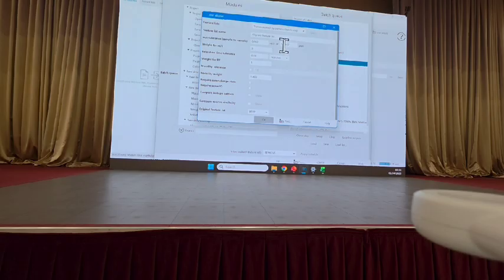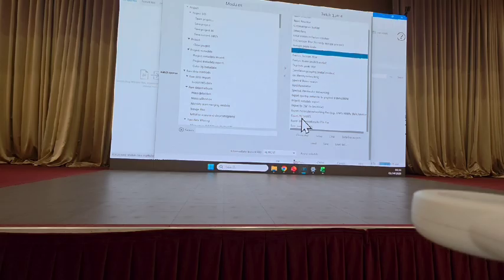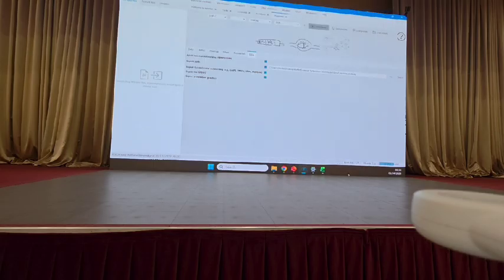And again, the best thing you could do at the end of the day is just play around with these once you get more familiar with them, and see how it changes your data from one setting to another. So what I'm going to do now, we're all going to press OK, and you will see in the bottom, it is now doing its thing.